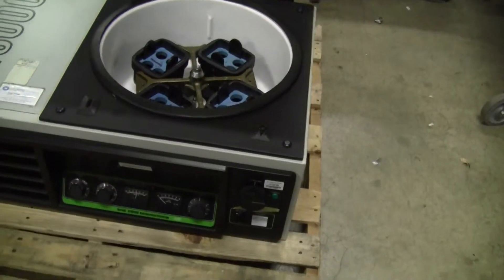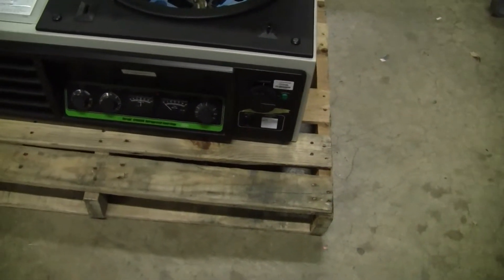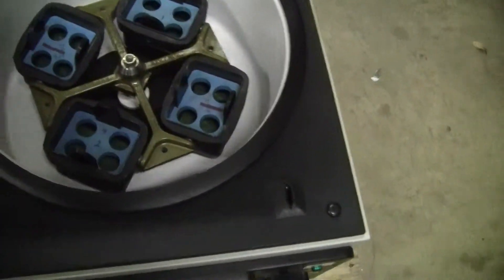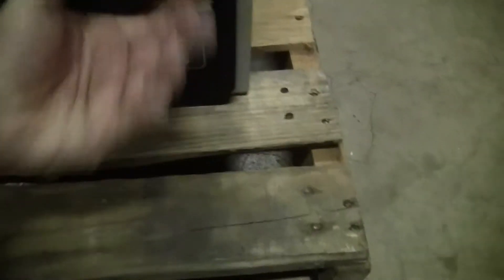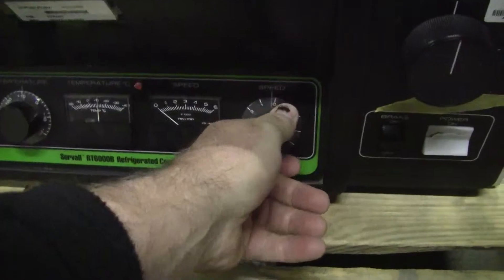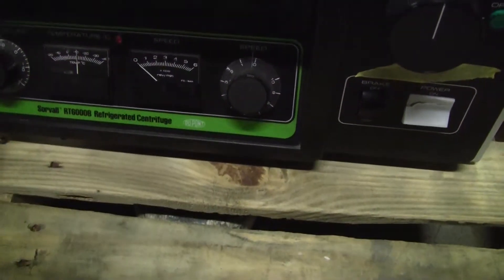It has a temperature range of minus 20 to 40 degrees C. You can hear the compressor on at the moment. Let's turn it on. It has a 30-minute timer where it can also be run continuously.